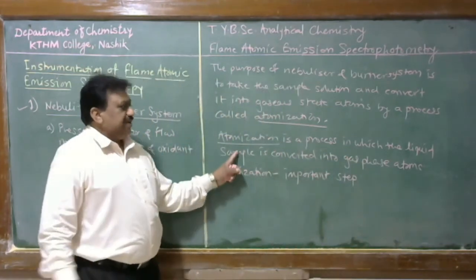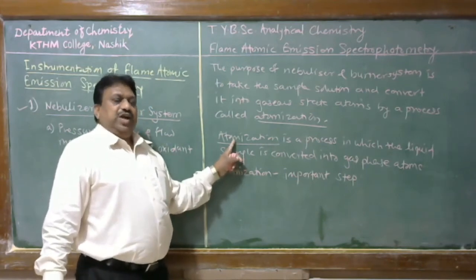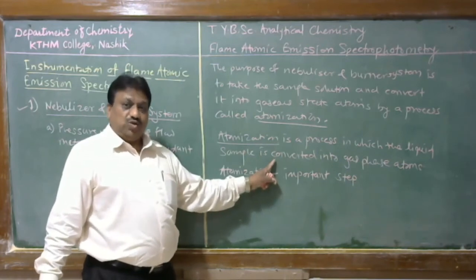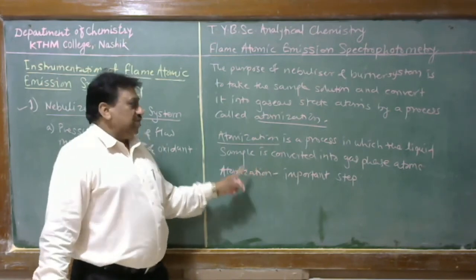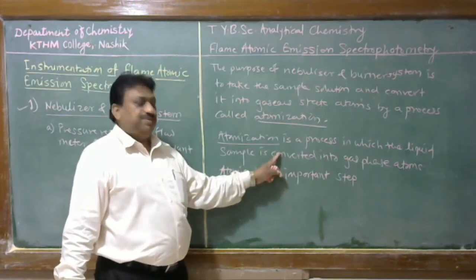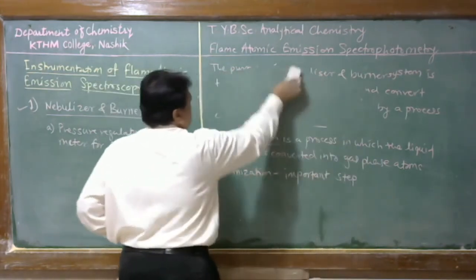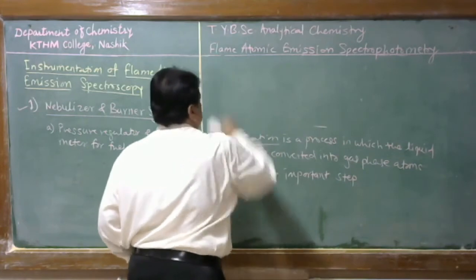The success of any atomic spectroscopy totally depends upon the functioning of the atomizer. The atomizer converts the liquid sample into gas-phase atoms, and the atoms are excited by the flame, which then gives the emission intensity. Therefore, the sensitivity and reproducibility of the measurement totally depend upon the functioning of the atomizer.